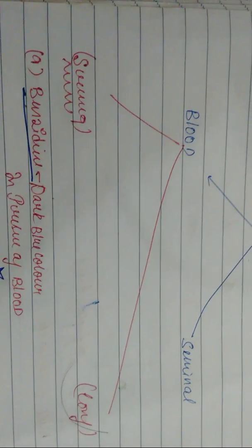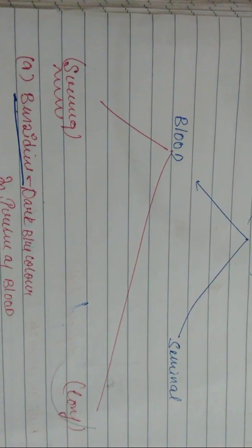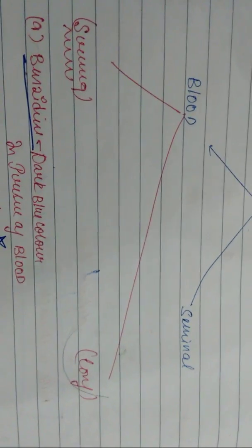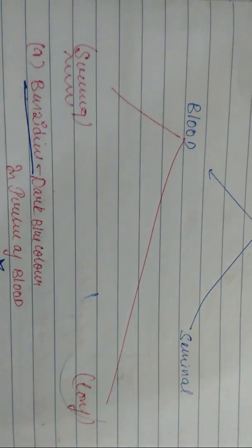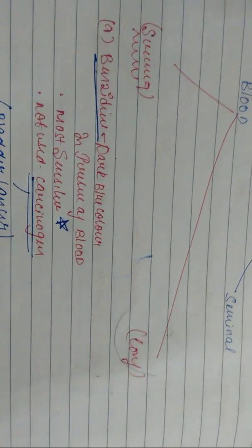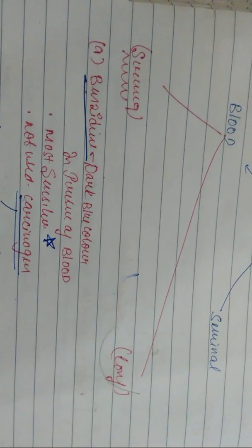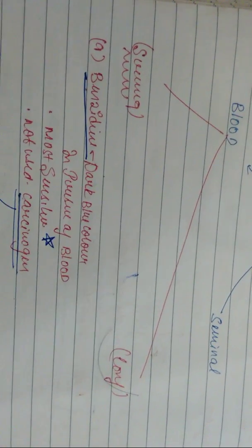For blood stains, you have something known as screening tests, and you have other tests known as confirmation tests. Under the screening test, we do some examination so that we can find out that yes, the stain is blood. The first test written is the Benzidine test.